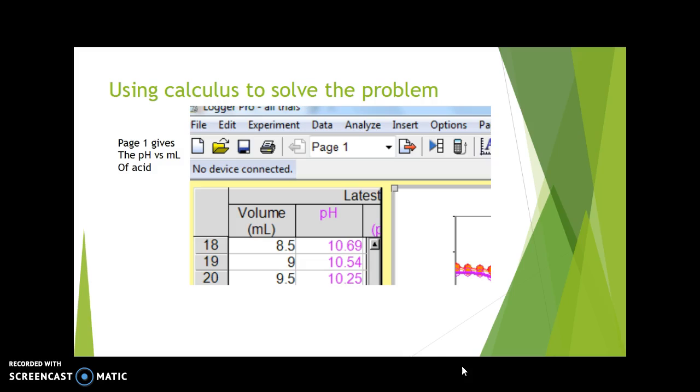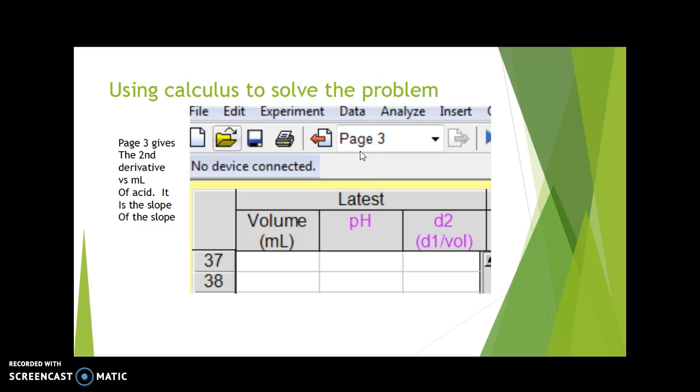On the Vernier graph, you're probably on page one, the one that looked like the previous slide. It gives the pH versus milliliters of acid added. What you're going to do is go up to the top of that page where I'm showing you here where it says page one, and click on this, and you will see page three come up.